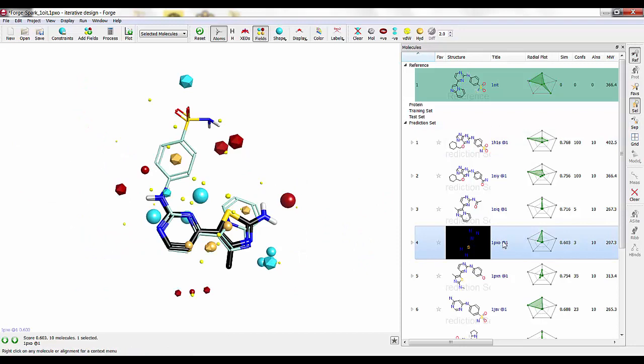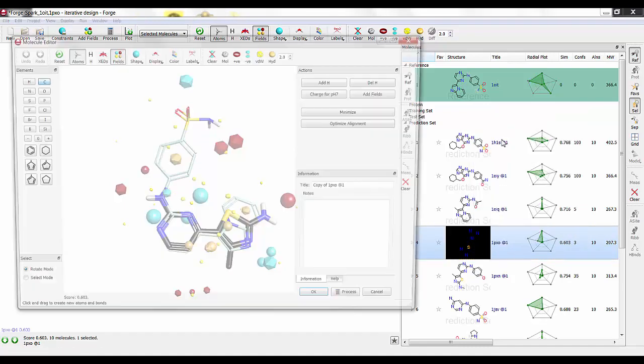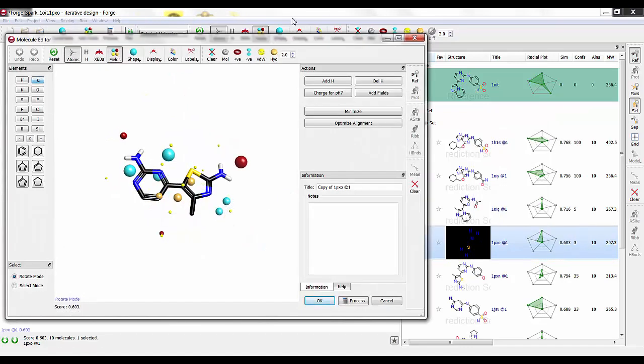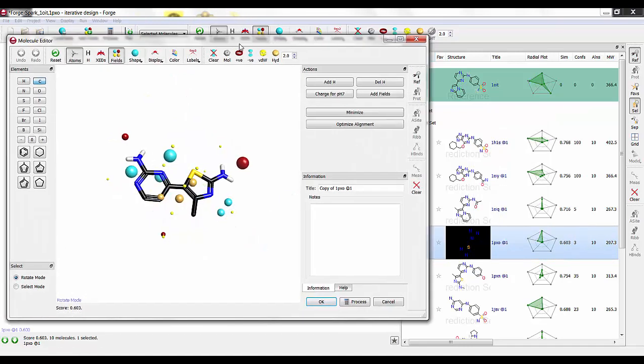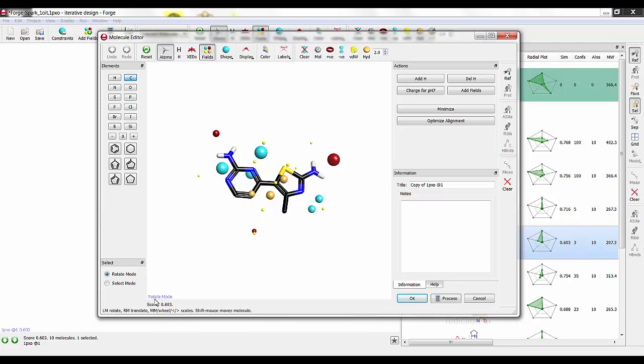Now what I want to do is I'm going to right-click on this 1PXO entry in the molecule table, and I'm going to edit a copy. So I'm going to create a copy of it in the molecule editor. What we see now is we have that 1PXO ligand.